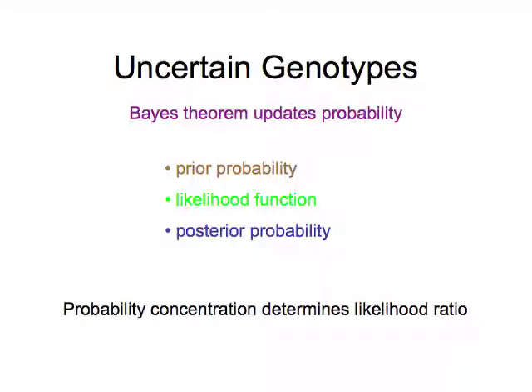We begin with a prior probability on each possible allele pair of a contributor at a locus, corresponding to the population probability. Before we see the mixture evidence data, that represents our belief about the evidence genotype. Now we see data, mixture data in this case. And in order to update our beliefs, we form a likelihood function.